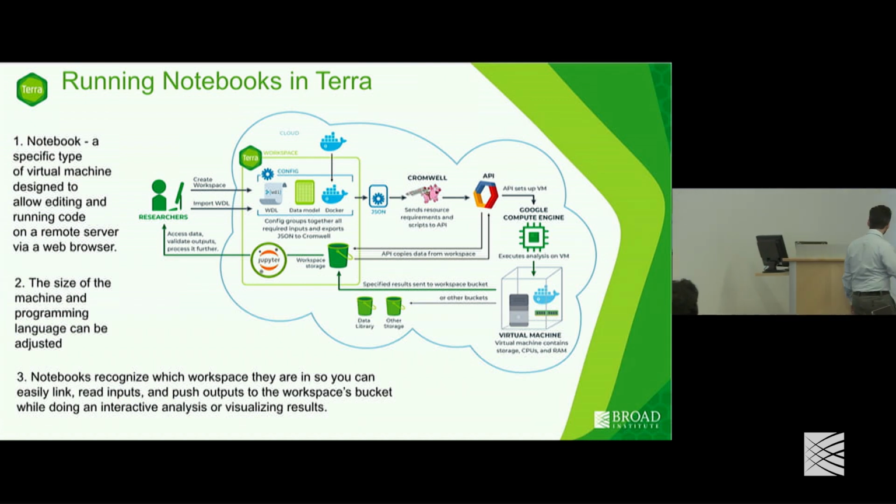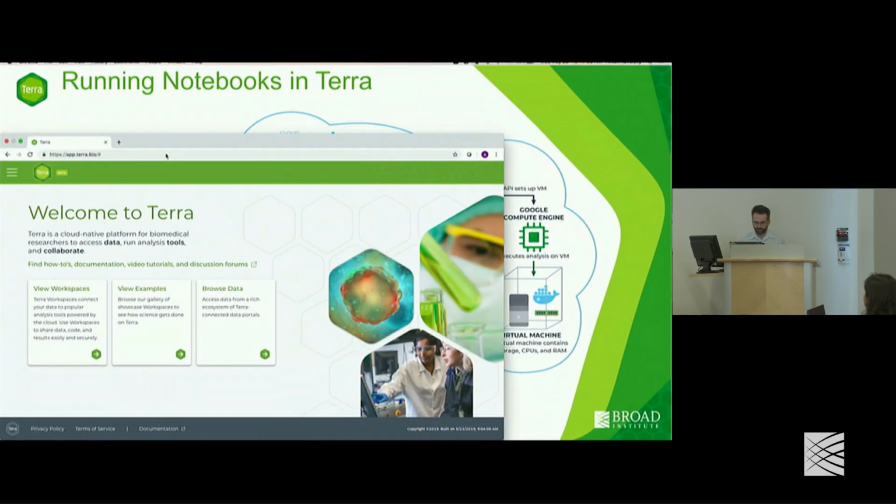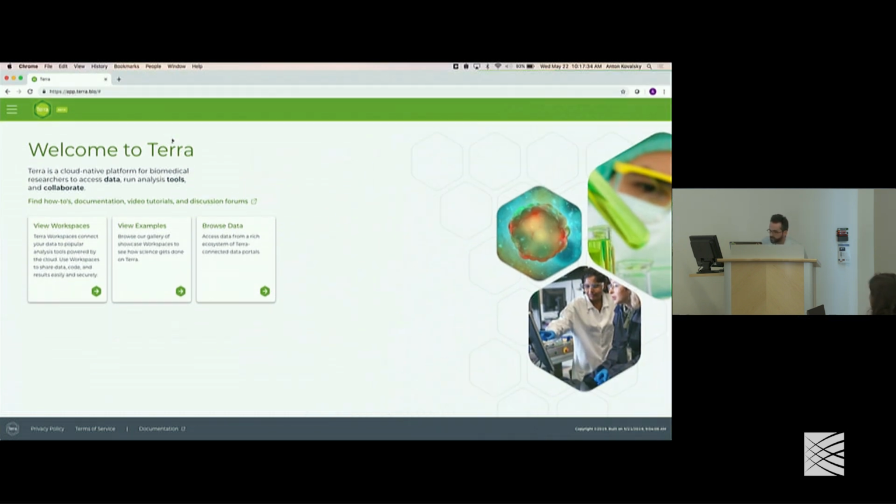So with that, I'm going to have everyone move over to Terra, and we'll actually clone a workspace and start our notebook.